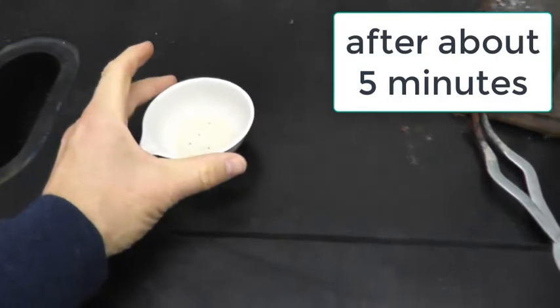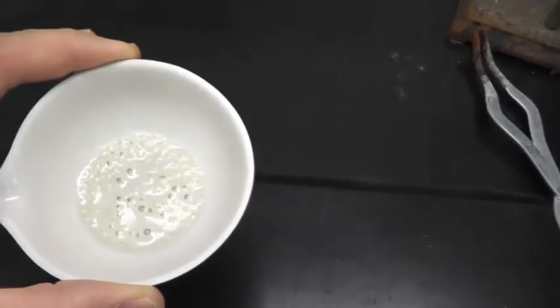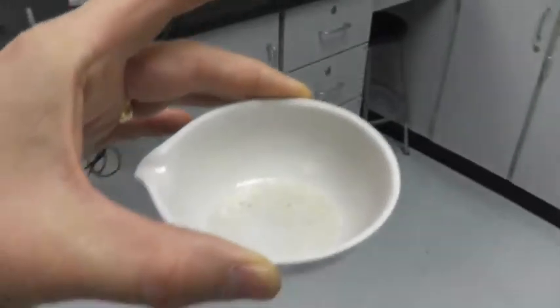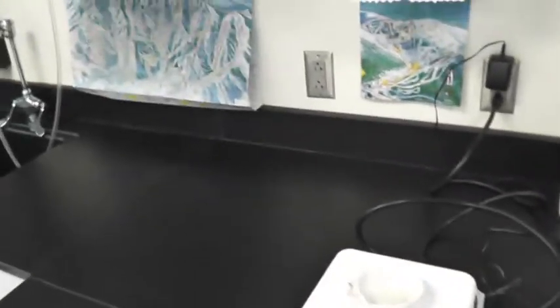All right, so at this point, we are good to go. You can see what it looks like. It's almost like a white paste. It's going to be hot on bottom, so we're going to bring this over and set it on the hot plate. And notice the temperature right now is 135.